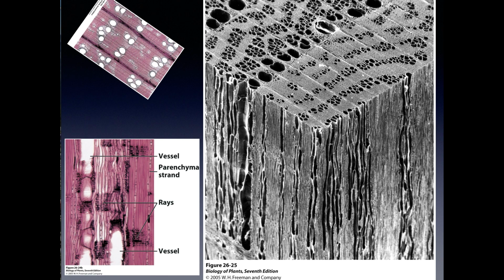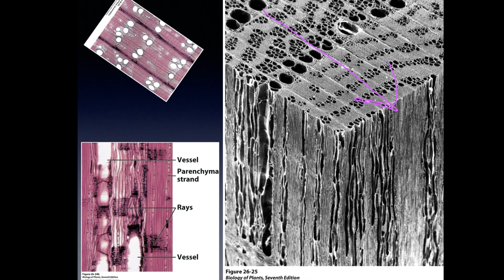There's something else that we can view now, now that we're seeing this whole composite of many years of woody growth. There are obviously longitudinal vessel elements. They are bringing water from down below ground to up above ground, and so they are vertically held. But there are these other cells that are growing laterally. They're growing out to the side, the opposite direction, or perpendicular to those vertically stacked vessel elements. These lateral cells are called rays.